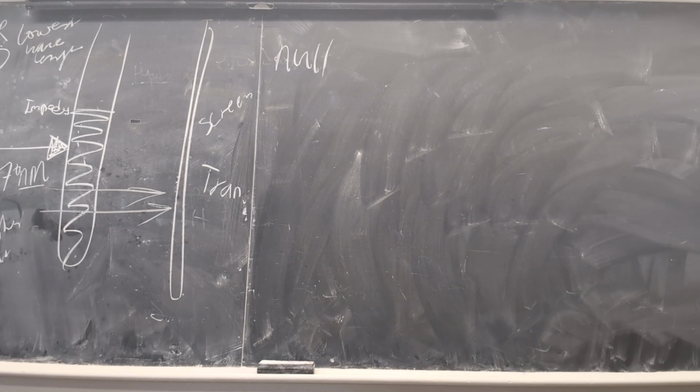So what are we doing here? When you put water, you have to set how much it transmits. No, that's the wavelength. This is the transmittance. How much should be transmitted? 100. It's water, so about 100 should be transmitted. This is the closest one. You're at 1. So make it 100. Way off.